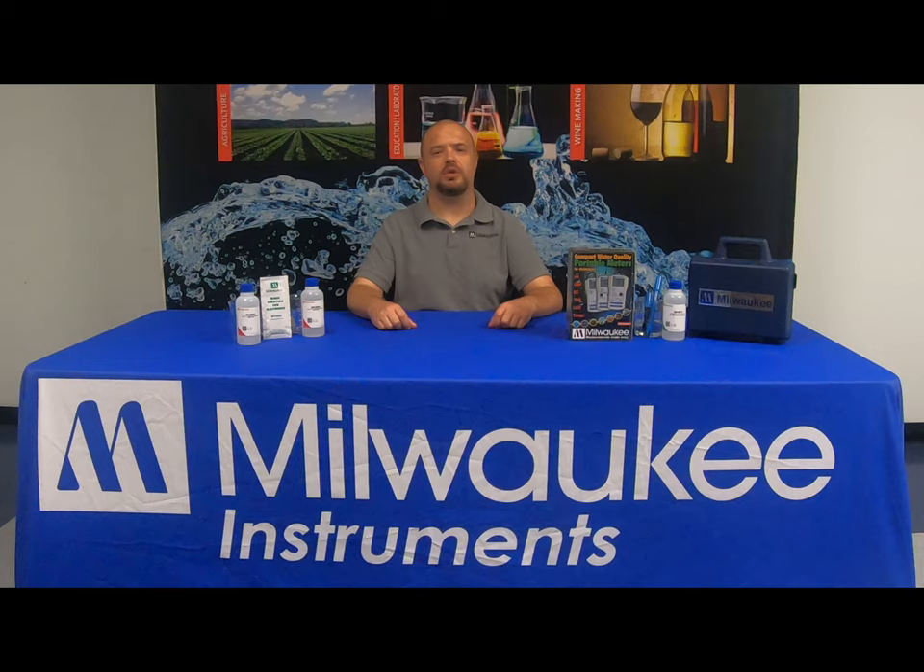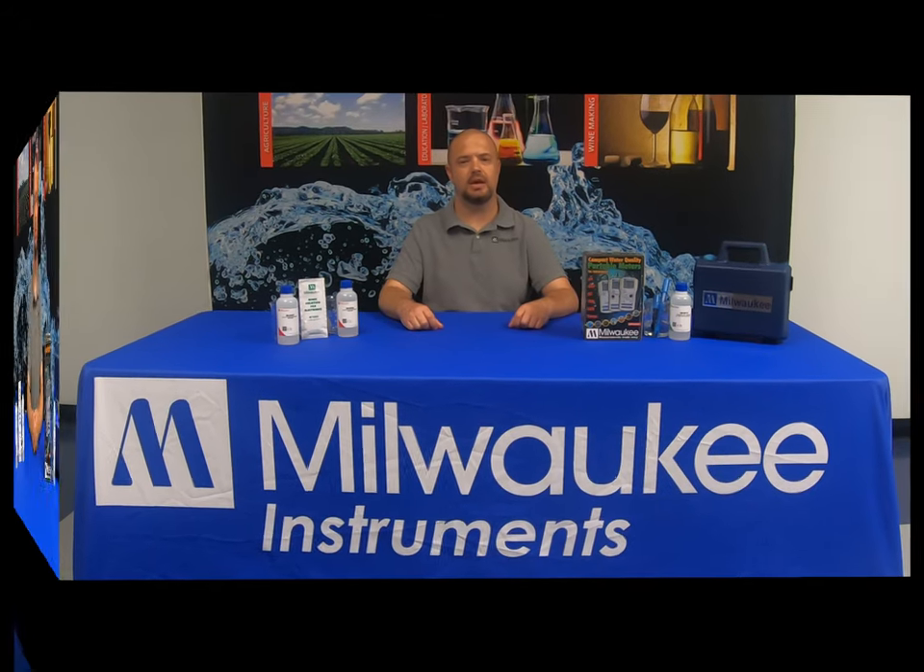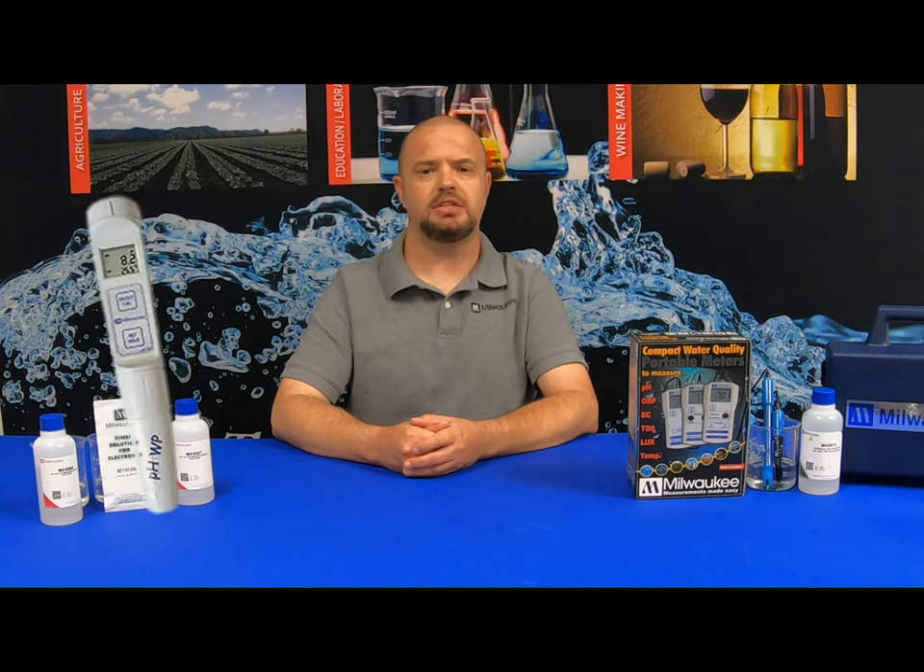In today's video, we'll be going over the calibration procedure of the Milwaukee Instruments MW102 pH handheld meter. In previous videos, we discussed the Milwaukee Instruments pH 600 and the pH 55 and pH 56 pocket testers. The Milwaukee Instruments MW102 is our top-of-the-line pH portable meter. It features two-point automatic calibration along with automatic temperature compensation.